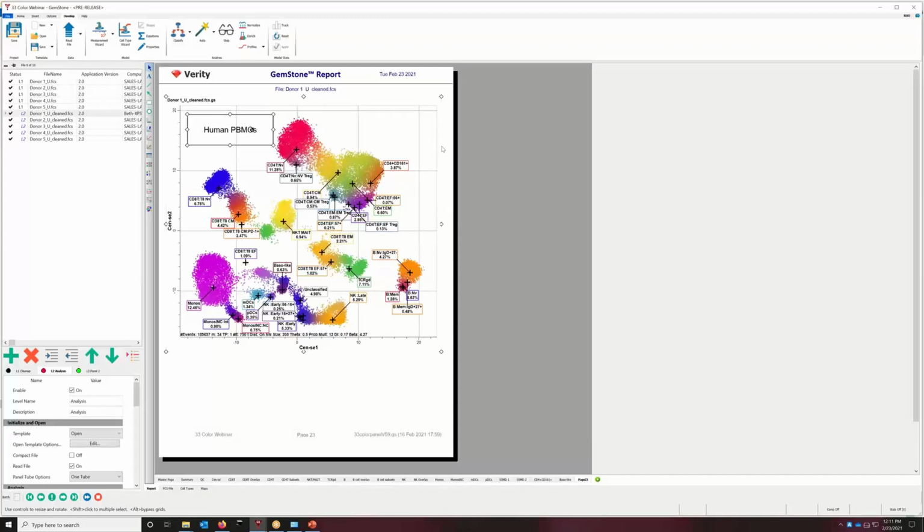You can draw an arrow to highlight a population. You can draw an ellipse to highlight a population. You can bring up the edit graphics window here, recalculate. And then we have these regions which are live regions. If I click on that polygon region, I'm just going to come here and draw a region here.